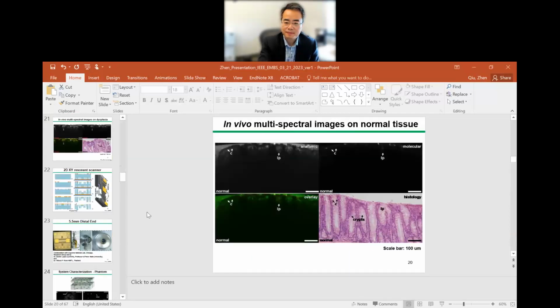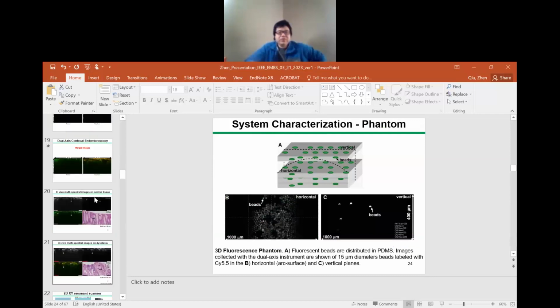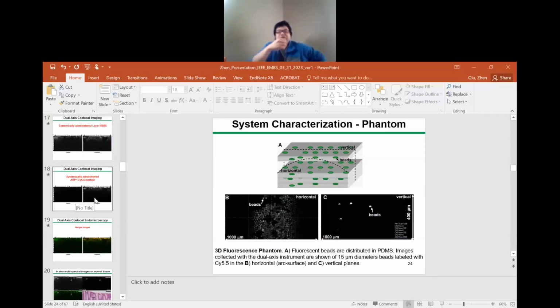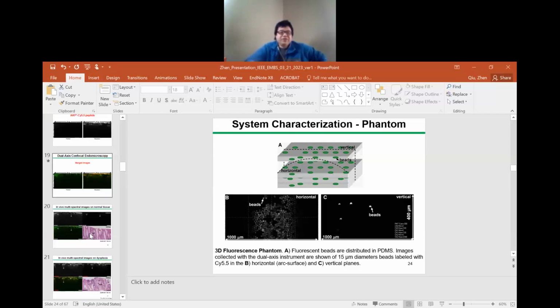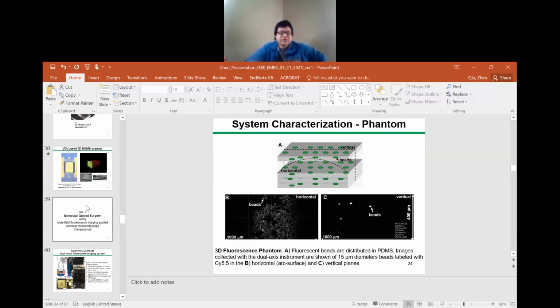Yeah, so for example, when you get the horizontal one, and then you move the system along the Z, and then you can do the stacking. For example, in Amira, there's a 3D stacking algorithm, right? If you get the vertical, let me show you. There's a cartoon I try to show how the vertical works.